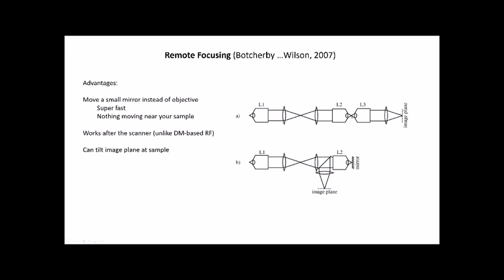It turns out that in the details, the aberrations that are created basically by being out of focus are sort of exactly canceled using the system. The odd ordered aberrations of the system are canceled. But this system that's drawn in A is actually equivalent to another system that looks like this in B, right?